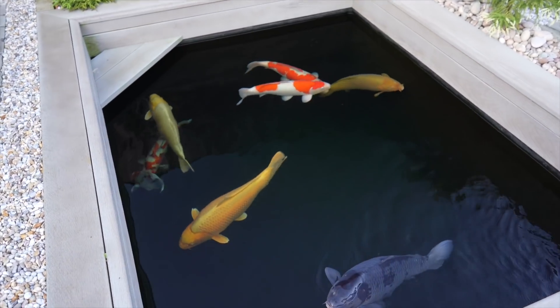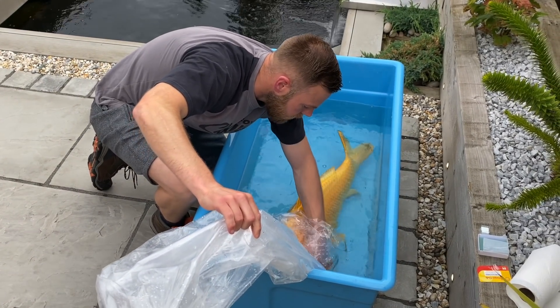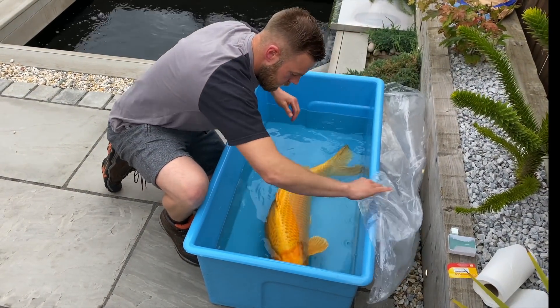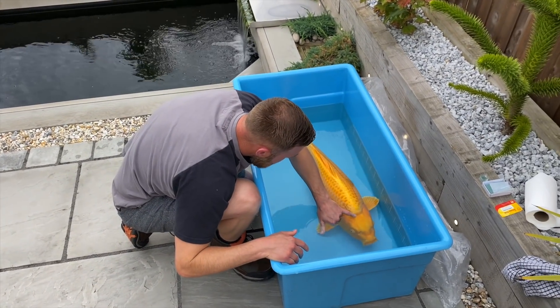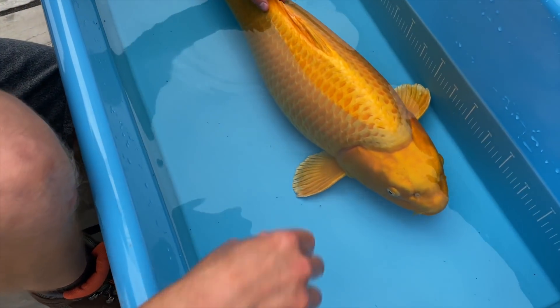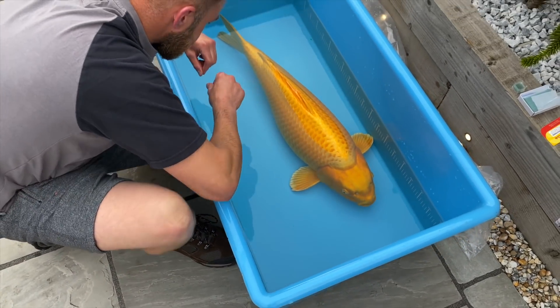I'm going to go to work and pick this back up when I get back. Visually this looks quite red, but there's not a single lump or bump anywhere. The slime coat's got maybe even quite a flick on here — this has just been knitting up over the last couple of months.